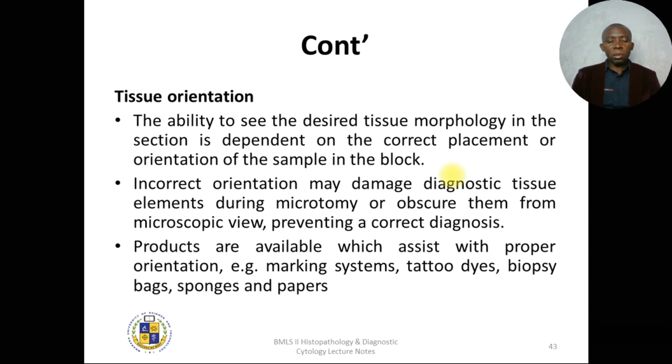So briefly, we talk about tissue orientation, and this is simply the order of how we lay or put our tissues in the mold as we prepare for sectioning.